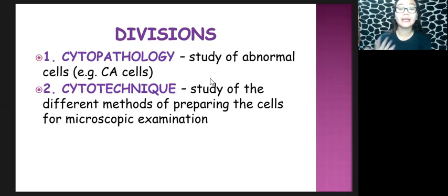The other one is your cytotechnique. Just like for your histotechnique, our concern here is to have the knowledge and the skills regarding the different methods in preparing your samples, in this case your cells, for microscopic examination.